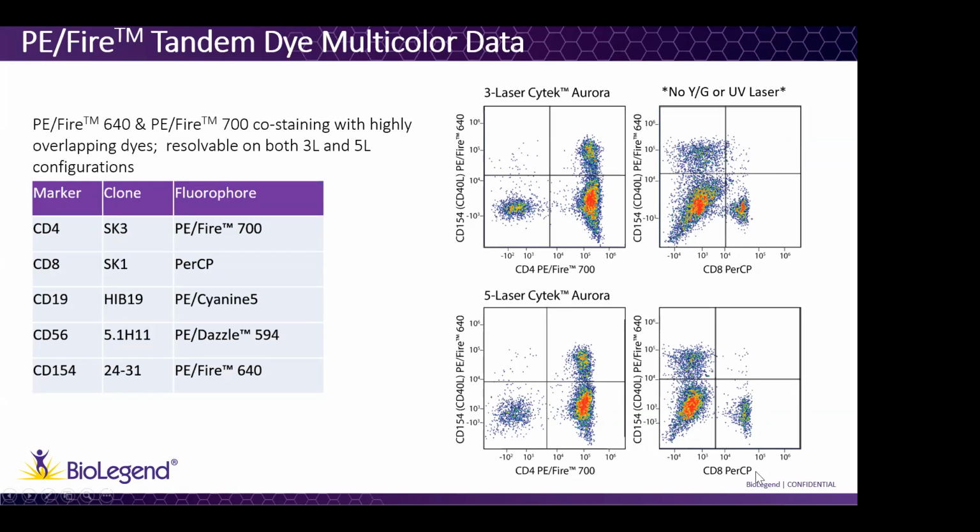So the profile looks really much the same. So you can use it with both instruments, 3 laser or 5 laser. There is not much difference.